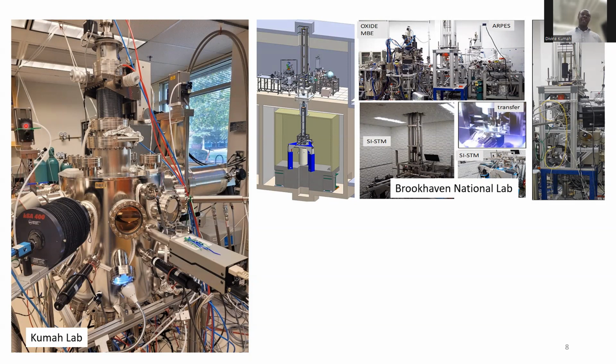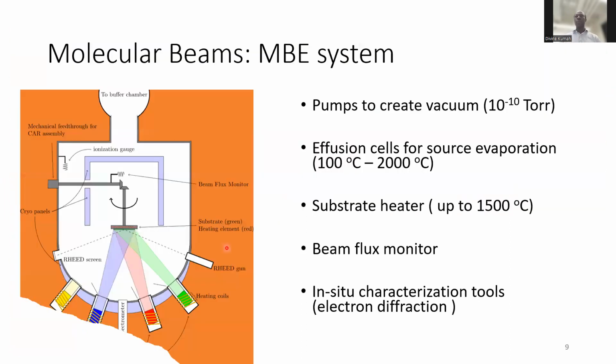And on the other side here, there's also a gate valve, which sits between the chamber in which you grow your material and a second chamber where you load or remove the materials. And the point of these gate valves is to isolate the MBE system from the environment, from the other tools, and maintain a really, really clean environment here for your growth.